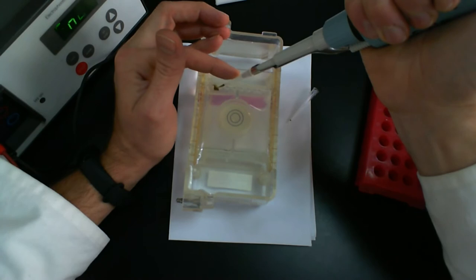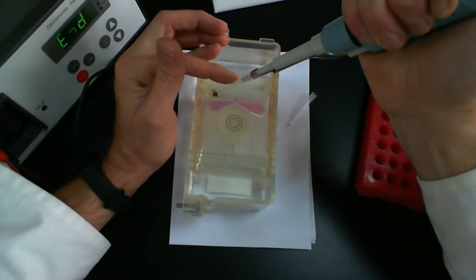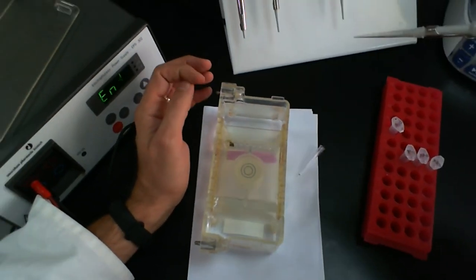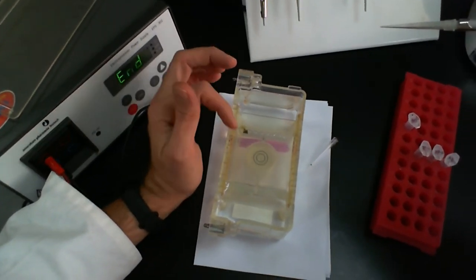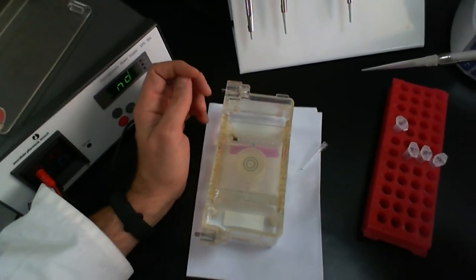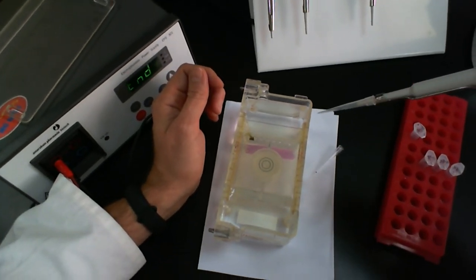And just eject slowly. And you'll notice that the sample is actually sinking to the bottom of the well. There's a little bit of leakage. Again, if you work slower and eject slowly, you'll have less of it leaking out. If you work quickly, you'll probably end up with a lot more leaking out. The trick is, don't go too deep. You want to have your tip just at the very top of the well.